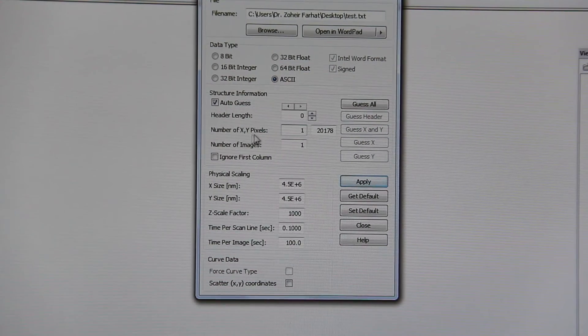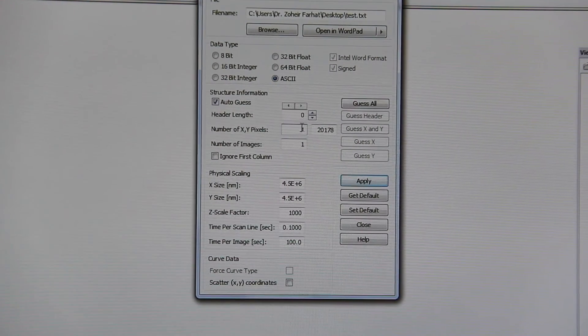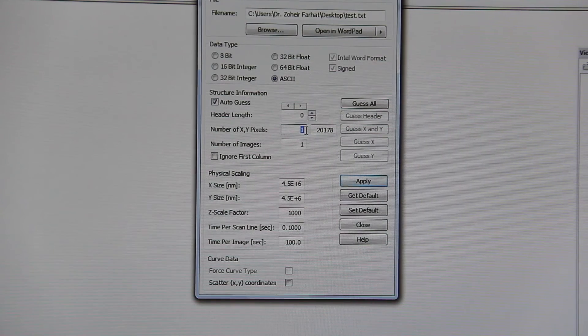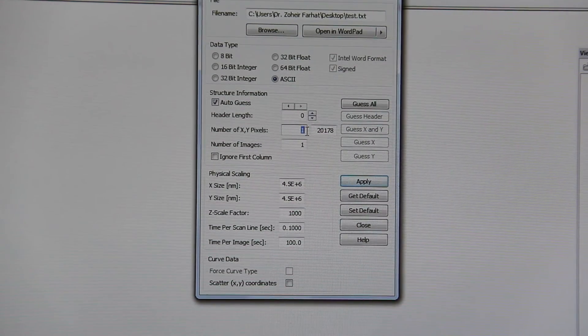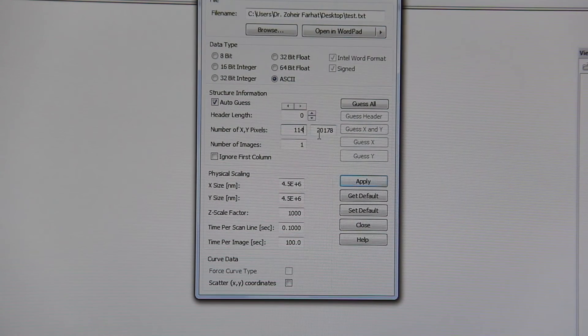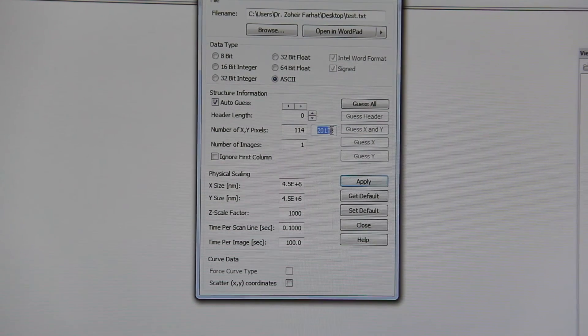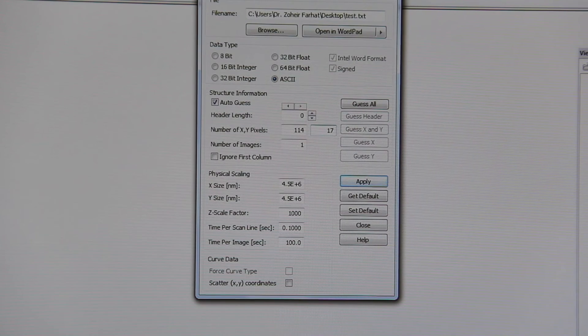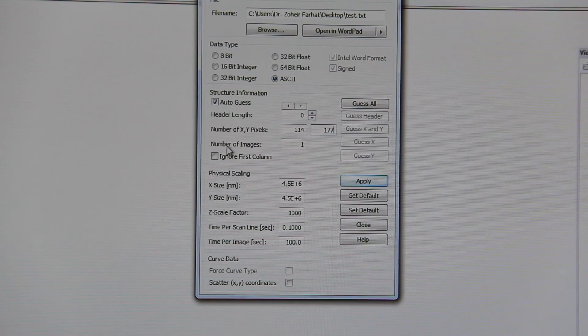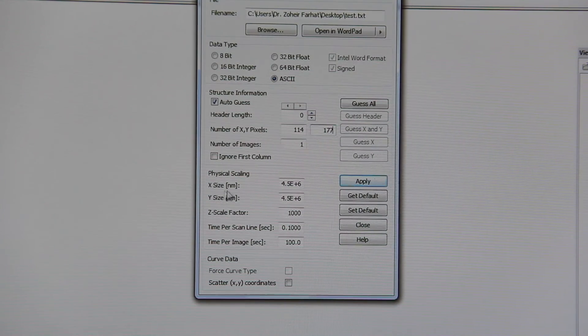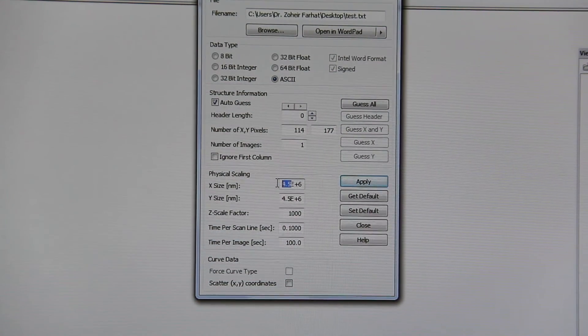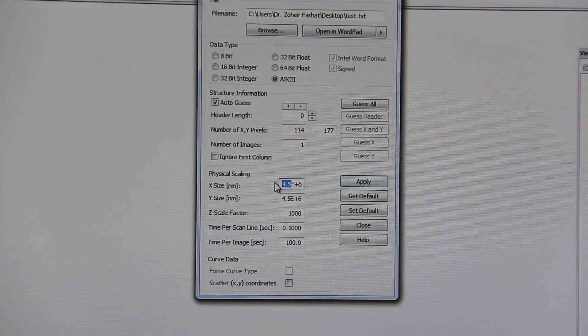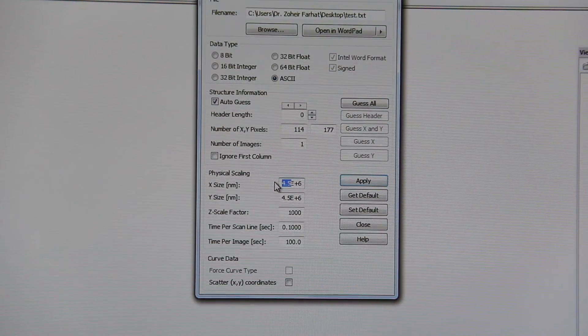Number of X and Y pixels. In the X pixel, the number of loops that we have done for X axis is 114. And Y pixel will be the number of loops that we have done in Y axis, which is 177.